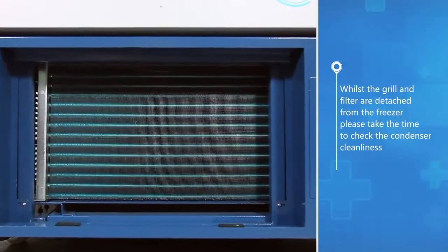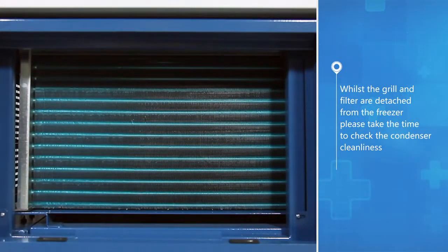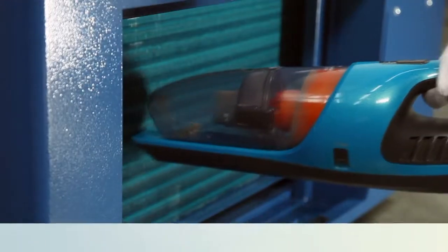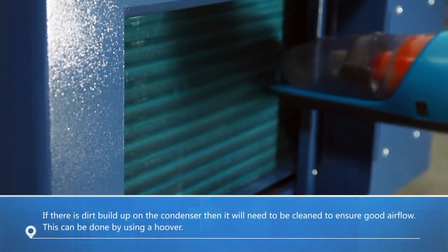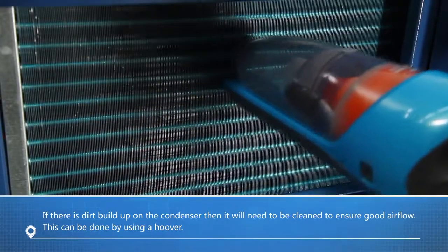Whilst the grill and filter are detached from the freezer, please take the time to check the condenser cleanliness. If there is dirt buildup on the condenser, it will need to be cleaned to ensure good airflow.